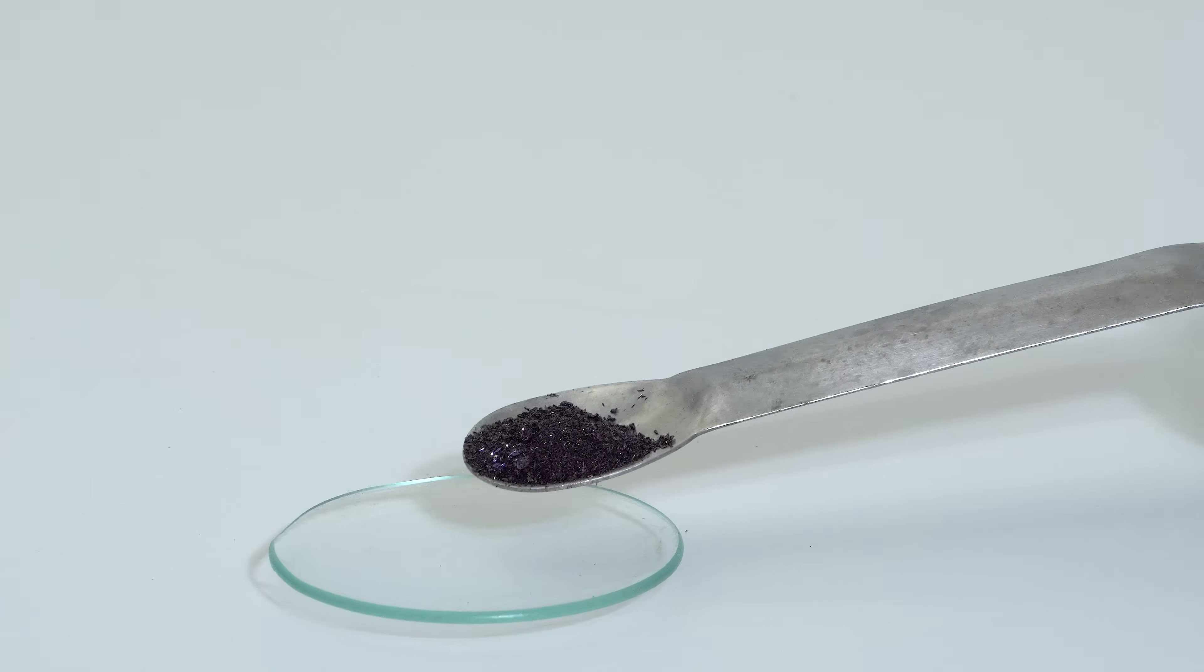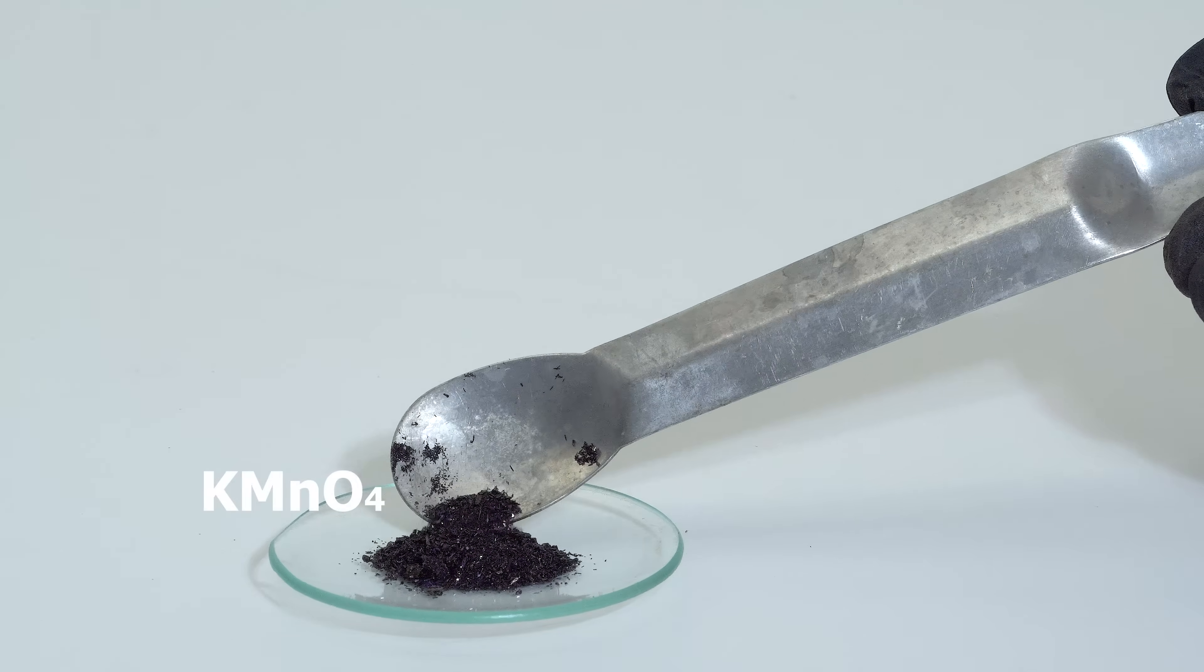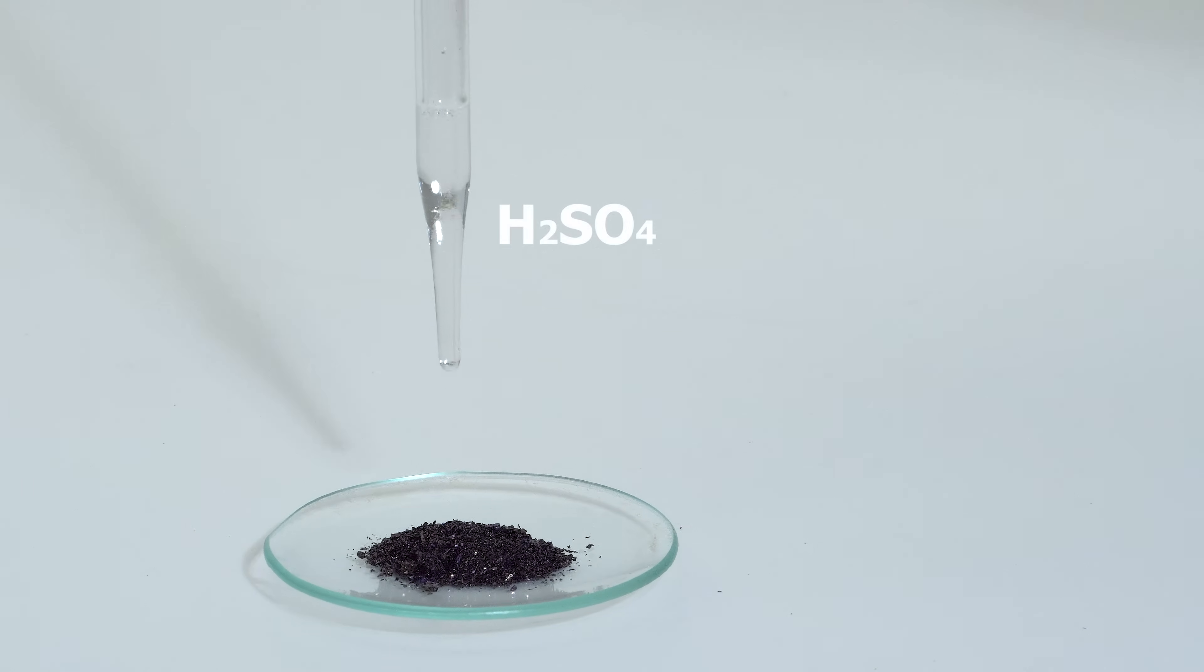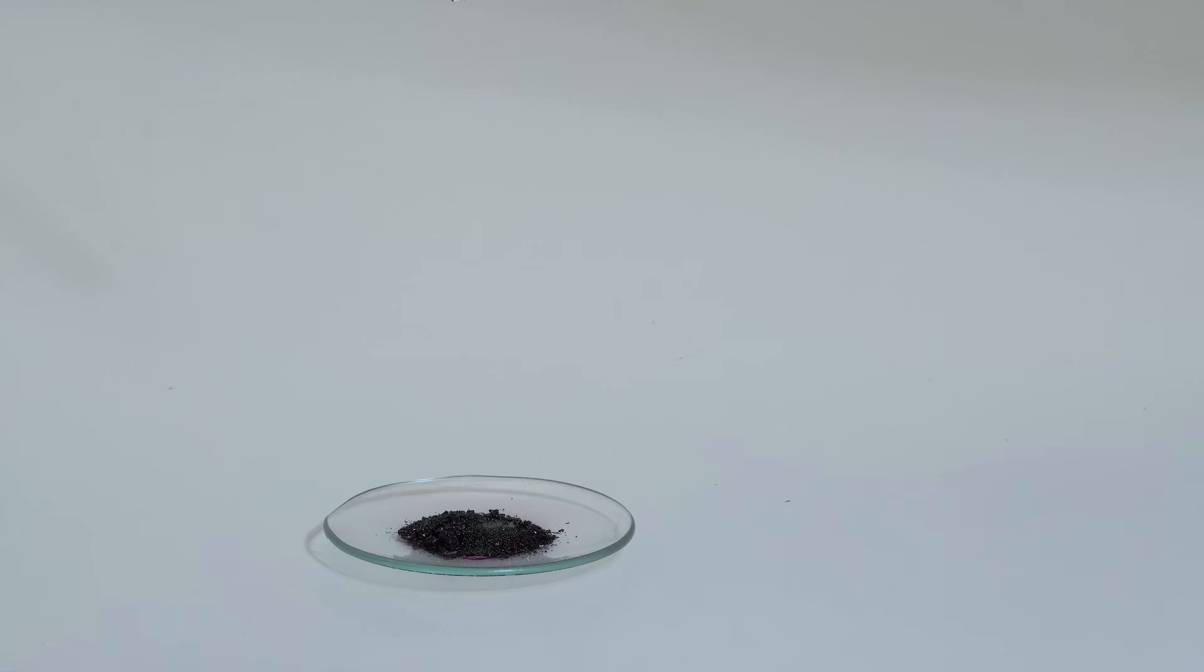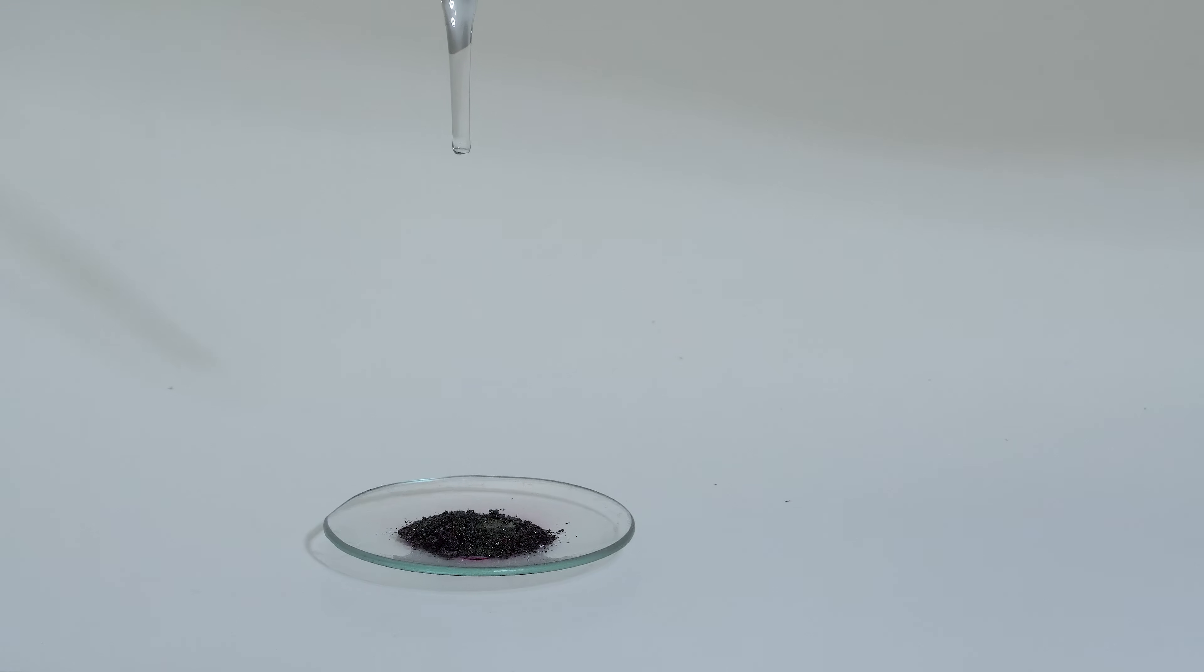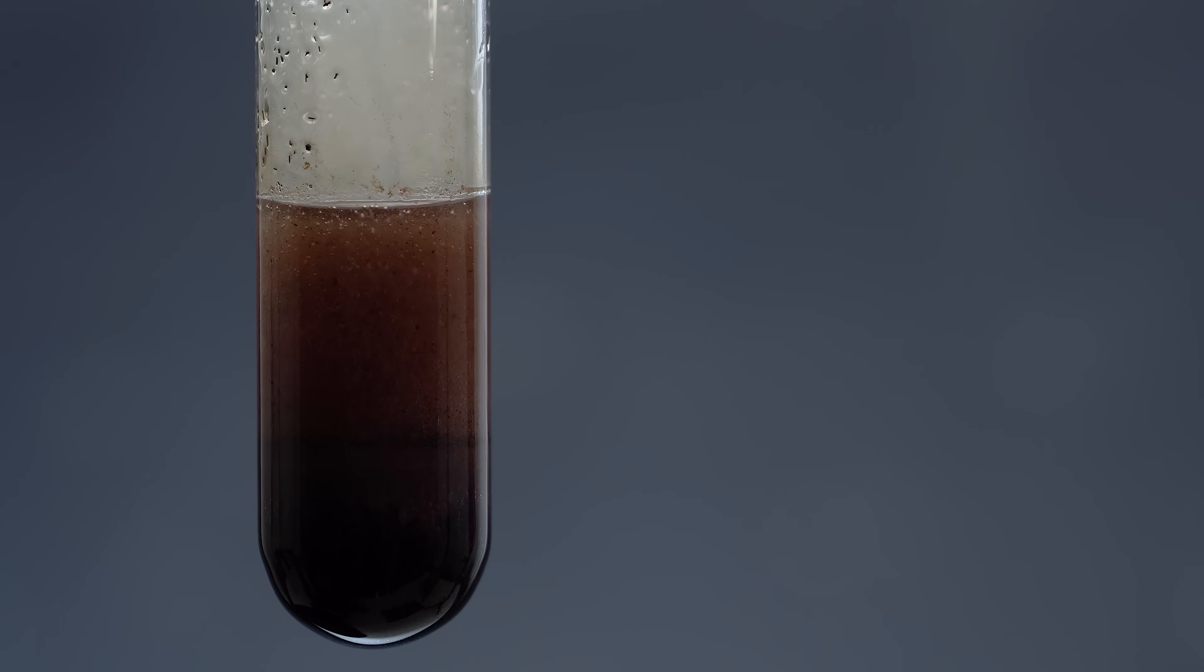The point of this experiment is that the reaction between concentrated sulfuric acid and potassium permanganate produce manganese heptoxide, which is an extremely strong and unstable oxidizer that inflames ethanol on contact with it.